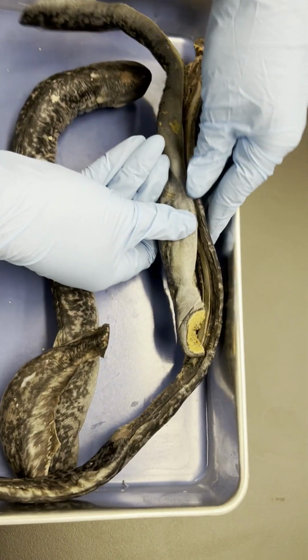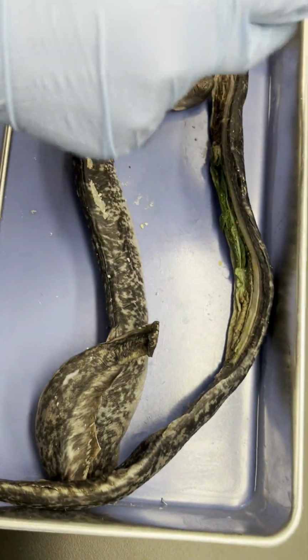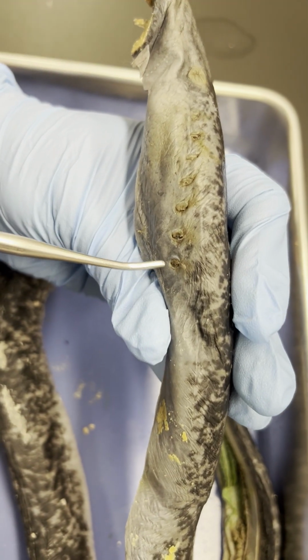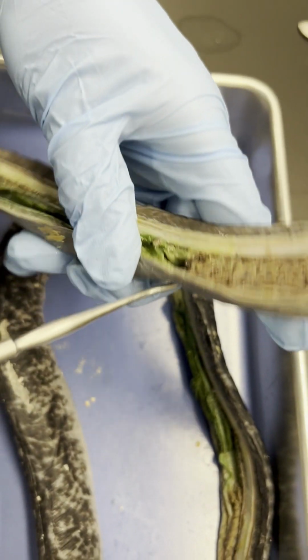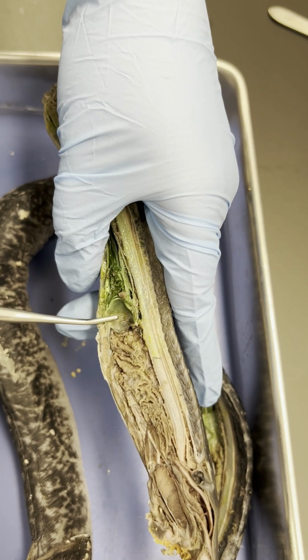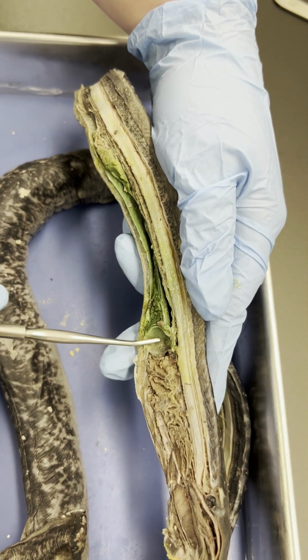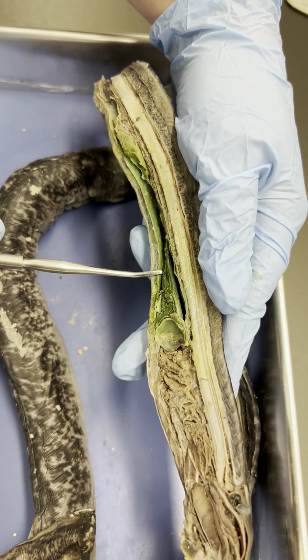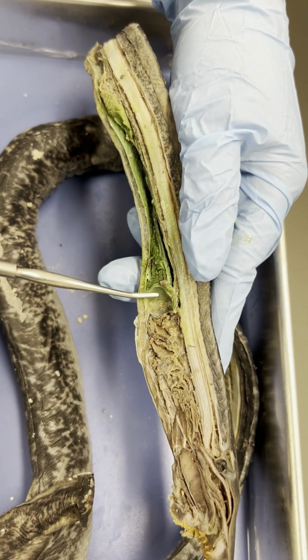Now, of course, they're not all the same size, but when I look at this, for example, we see our 7th, which is our last gill slit, since we know that they have 7 gill slits. And if we flip that over, we can see that that lines up with the pericardial cavity. So I know that when I'm making the cross section where I want the liver and intestines, I'm going to go a little bit lower. And that will still give me the liver and the intestine, but I'm not going to be cutting into that pericardial cavity.